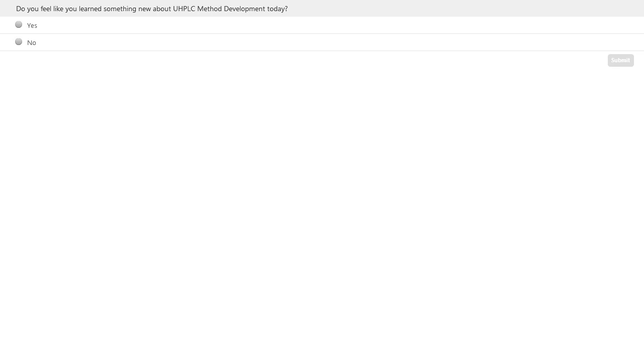Someone asks if you'd be able to explain again how to correct for porosity for translating gradient methods. Okay, no problem. It really depends on which brand you're working with as to how porous the column is, and it relates to the column volume. So the porosity is only going to change the volume of the column. What I mean by that is when we work out column volume, it's basically the volume of a cylinder, so pi r squared h, times by this porosity factor.